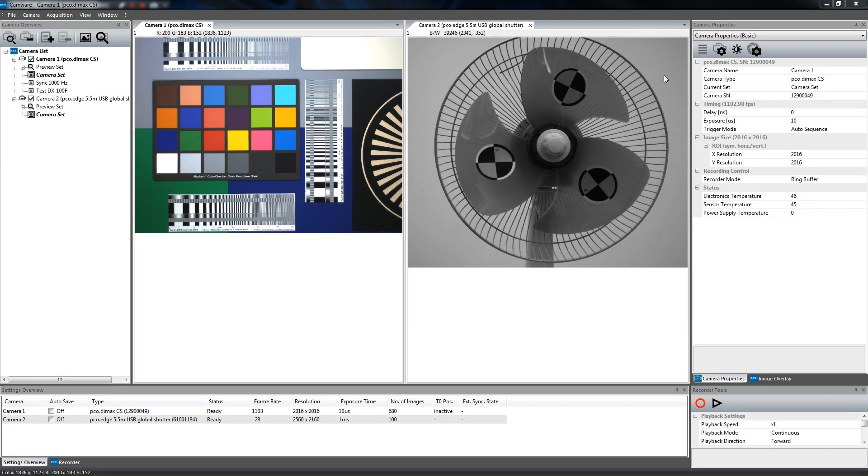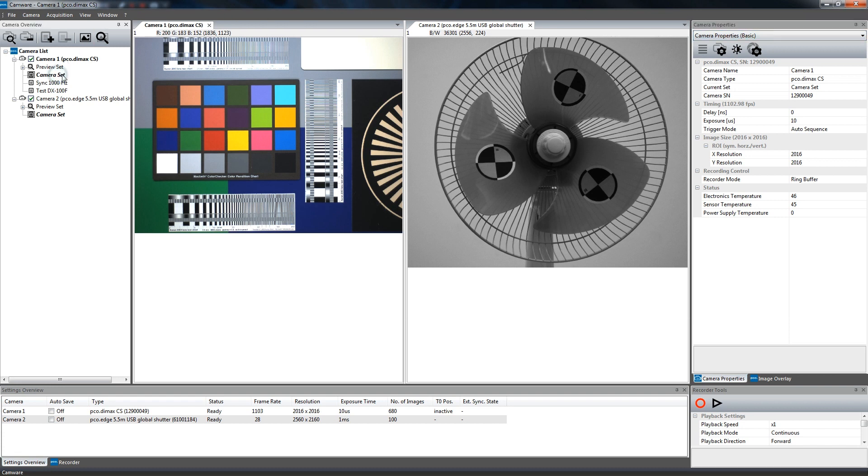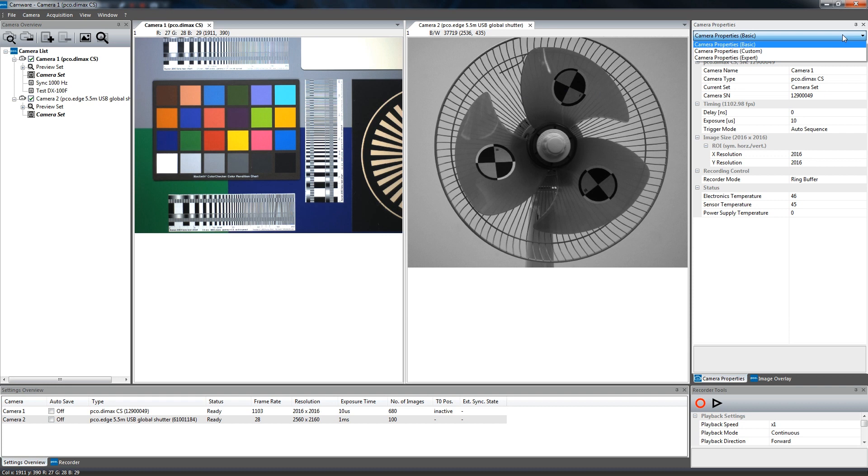The camera properties window on the right hand side is the main interface for all camera settings. The active set selected within the camera list is adjusted here. Basically, three view options can be selected for the properties dialog: Basic, Custom, and Expert.